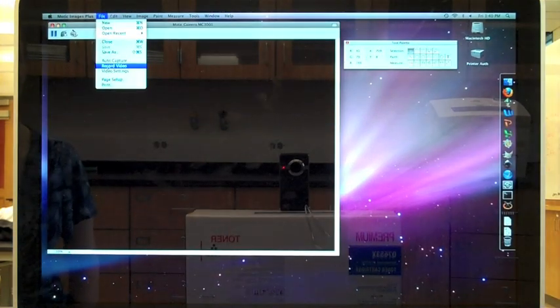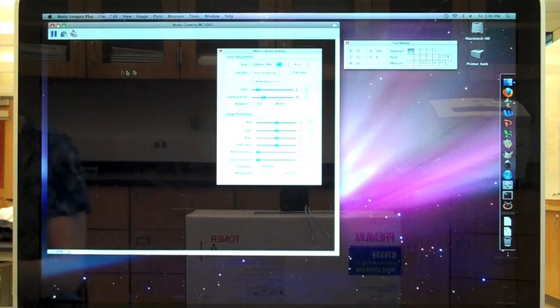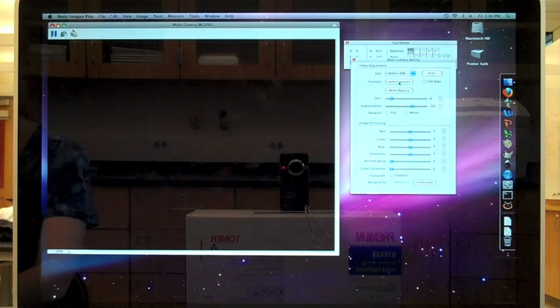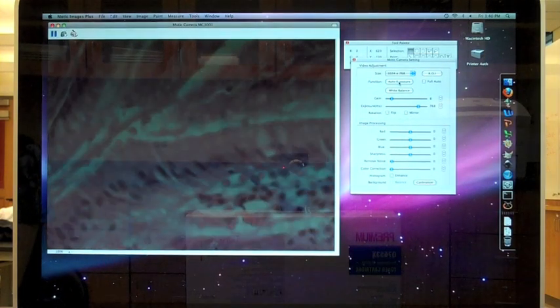Now click File, Video Settings. Here you'll see an array of options. To start, click the Auto-Expose button. This will change the light exposure and provide a clearer image.